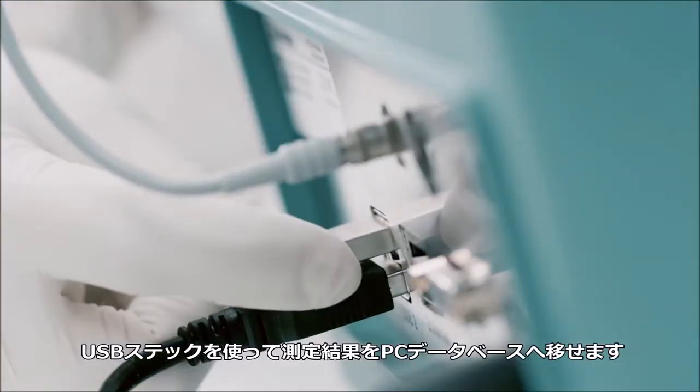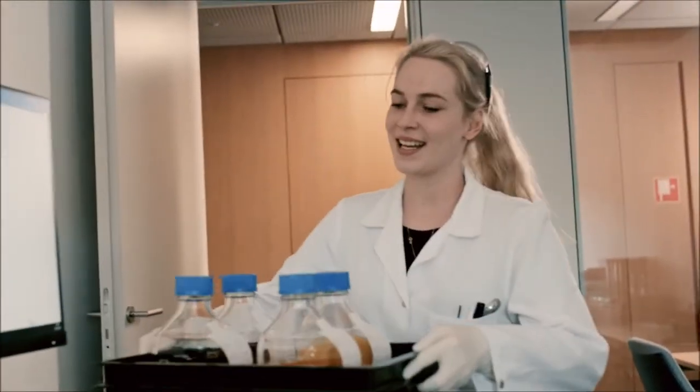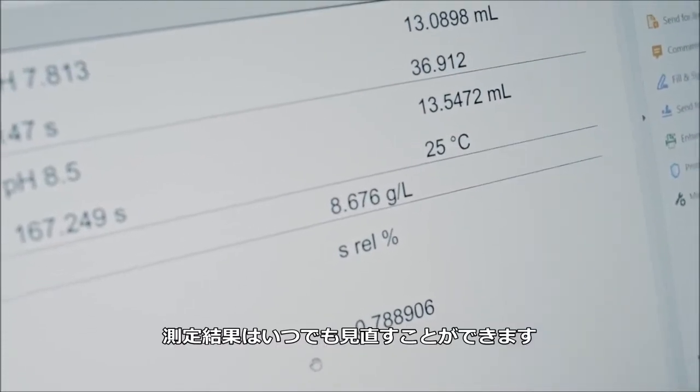Use a USB stick to transfer your titration results to your database. Documentation complies with GLP requirements and can be reviewed at any time.